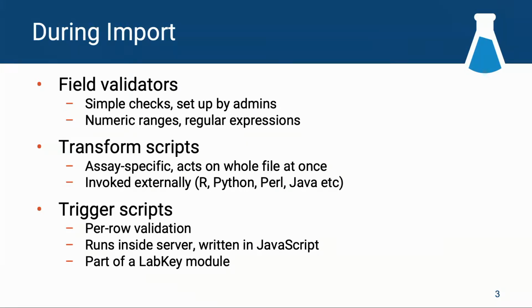We have other capabilities called transform scripts. These are specifically attached to assays. They run on the whole file that's being imported.